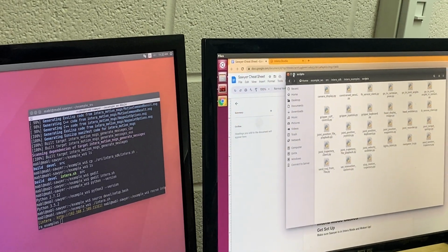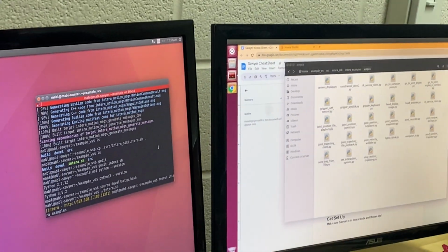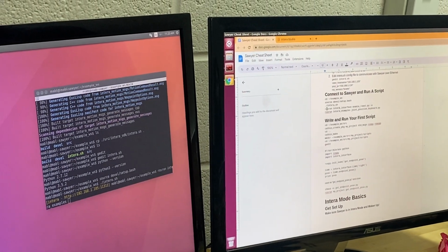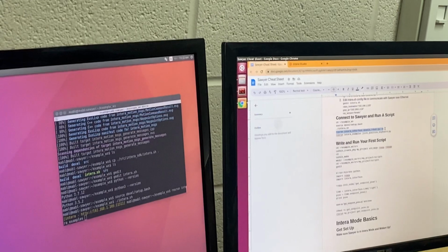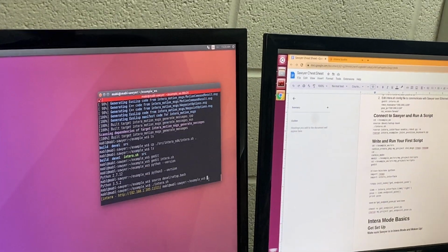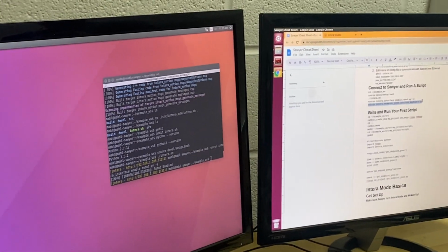Is there a tools, like in Intera tools, like Baxter had tuck arms, enable, disable, all that? Yeah, this does have an enable. Did I write enable in here? I did. Okay. Obviously there isn't really a tuck arm or anything, because it's just one arm. So robot enable. Now we can actually run one of these examples.